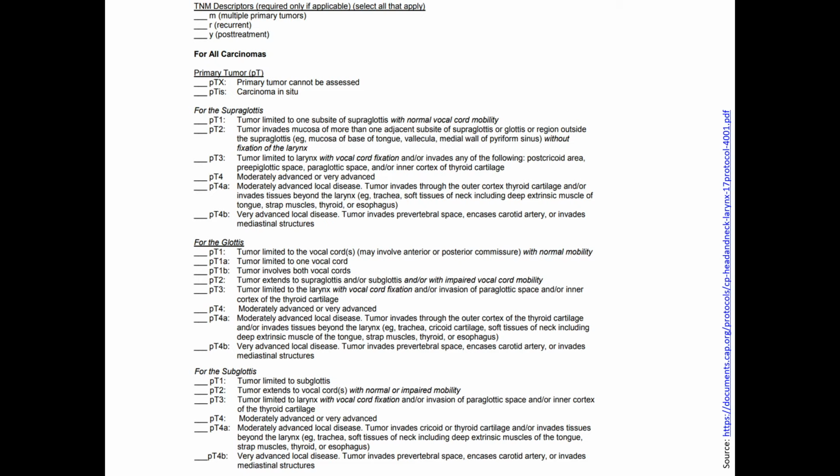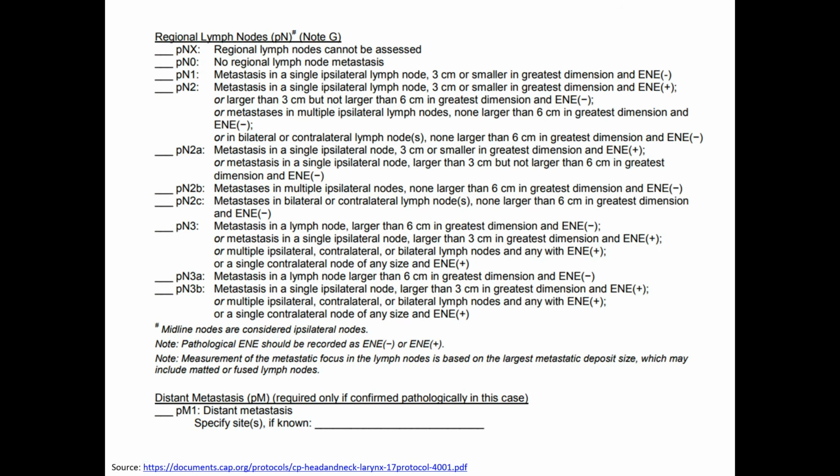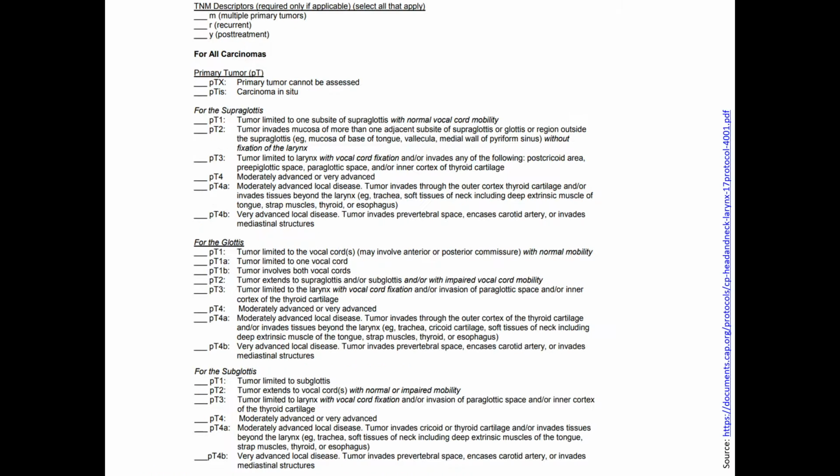Sure. So, unfortunately, for the T stage, let me just lead off with the word unfortunately, I don't know how much help I'm going to necessarily be. The T3 trick is the one that I remember most of the time. Usually, when larynxes come out, the typical story is that it's an advanced disease to the point where the vocal cords are already immobile or impaired significantly.